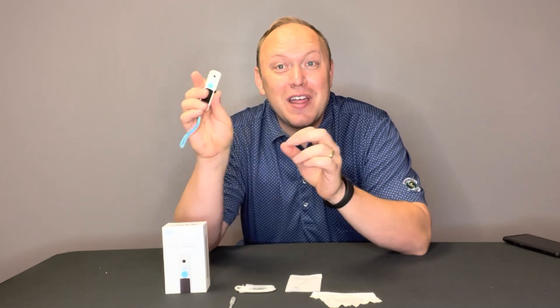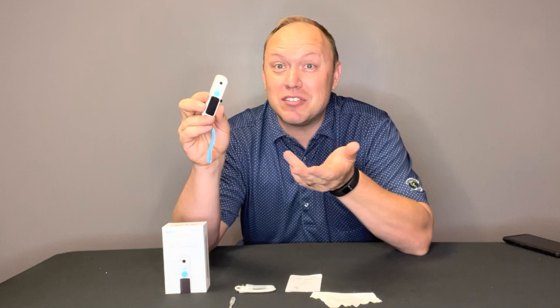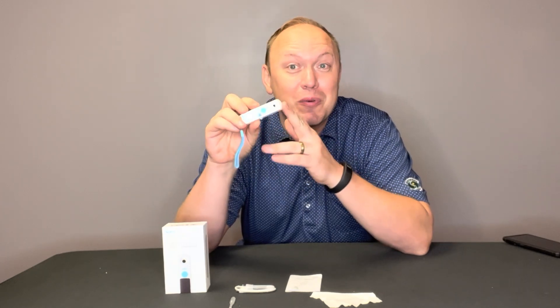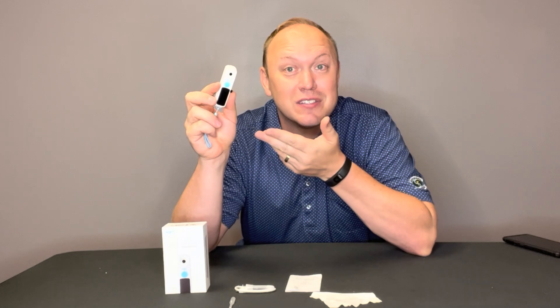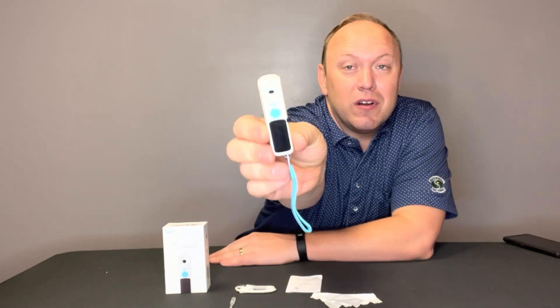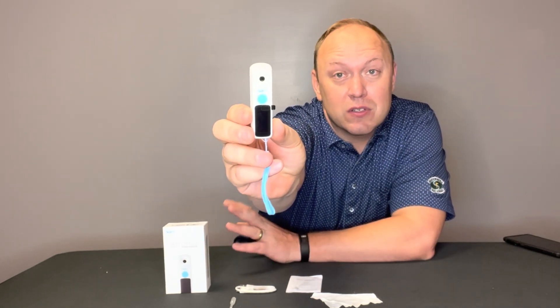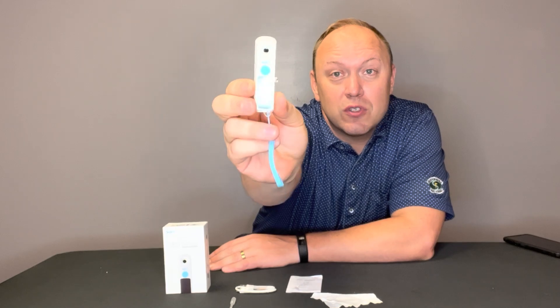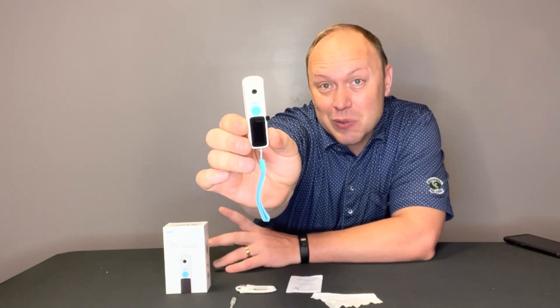I think this would be a great tool for any chef in the kitchen, any scientist — this would be good for projects in school. There are a lot of neat applications, and there are other refractometers that can test other dissolved solids as well. Really neat tool, something you may not have heard of, but if you need to measure the sugar — particularly if you're diabetic or something like that — this is a useful tool to verify the amount of sugar in any solution or drink.